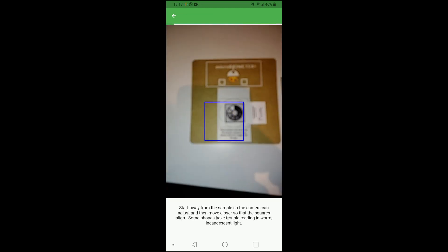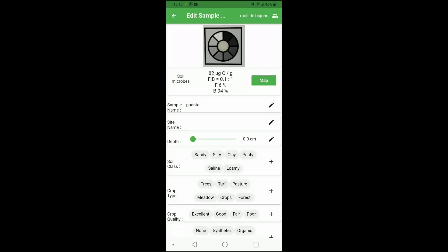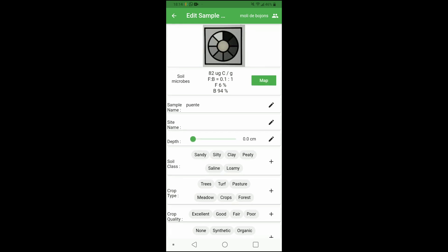Let's see if we can get another result. With focus locked and a steady hand moving closer in, we've got our test results. You can see 82 UGC per gram. The FB is the fungal-to-bacterial ratio — in this case I'm looking at 0.1 to 1, with about 6% fungal activity to bacteria at 94%. You can fill in the rest of the information here based on how you want to store the results in the app.